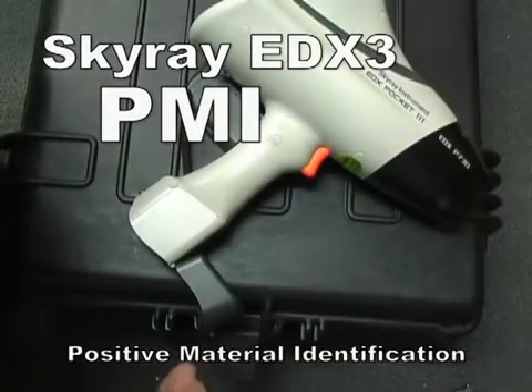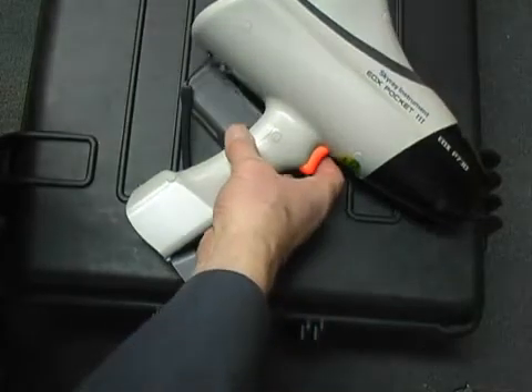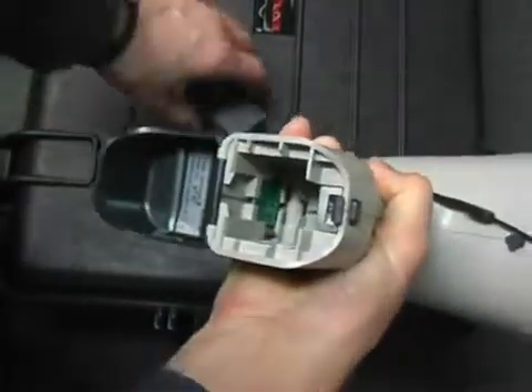I'll now demonstrate using the SkyRay EDX3 to test an alloy sample. We need to insert the battery.